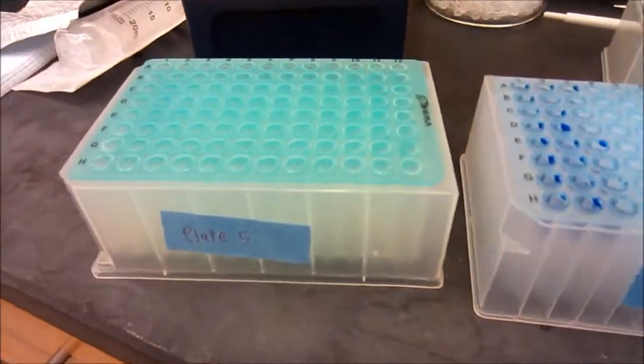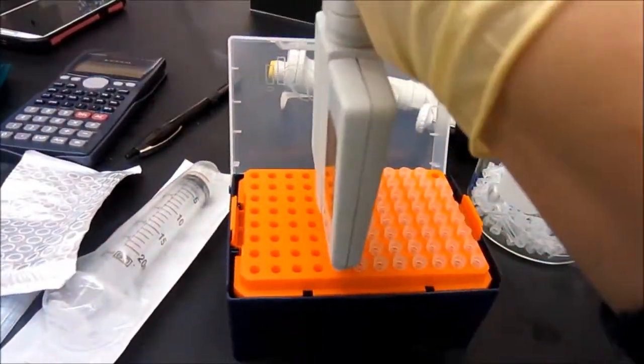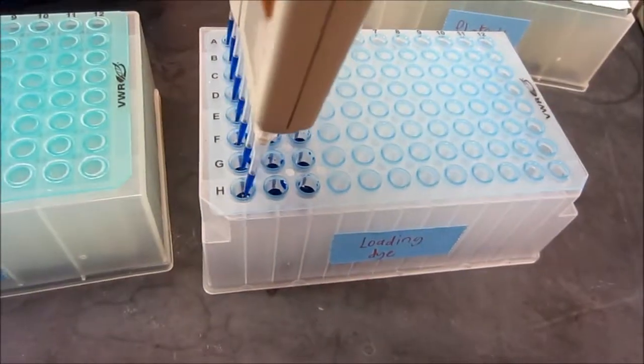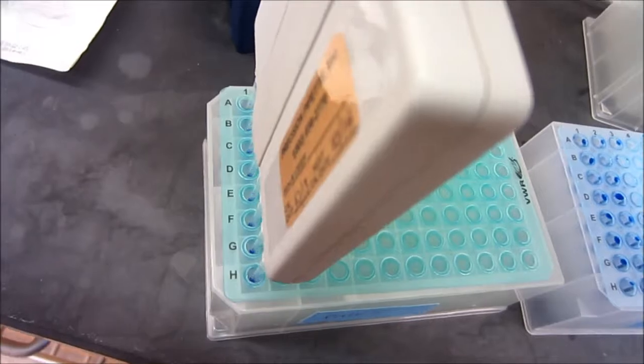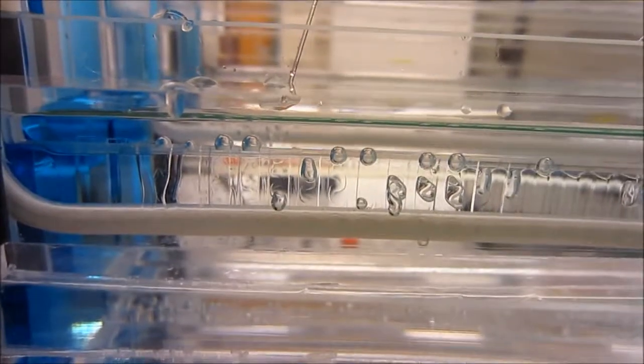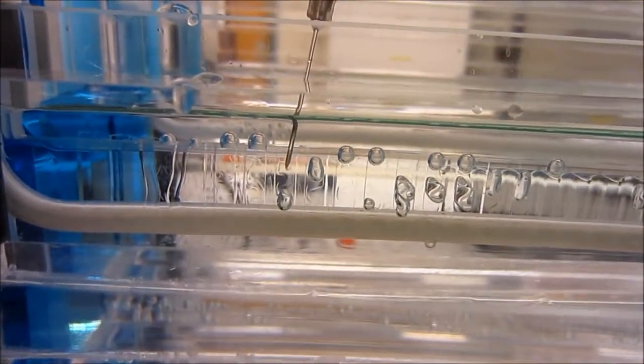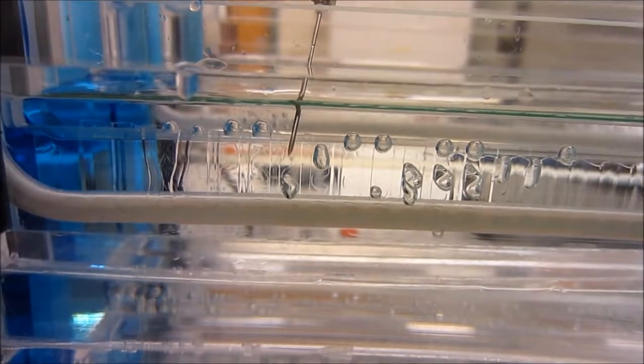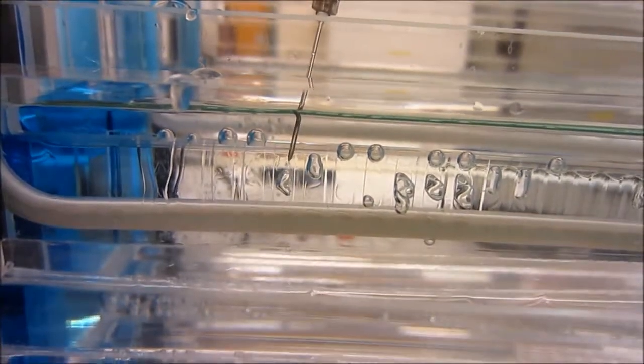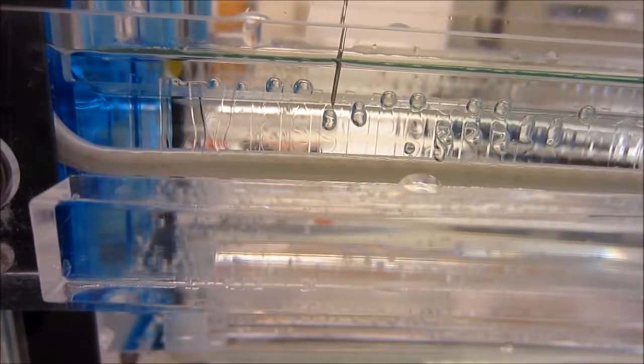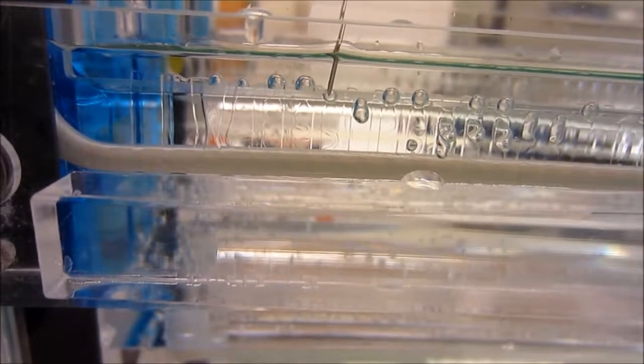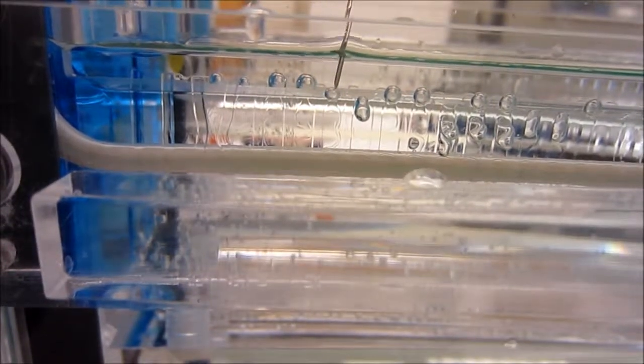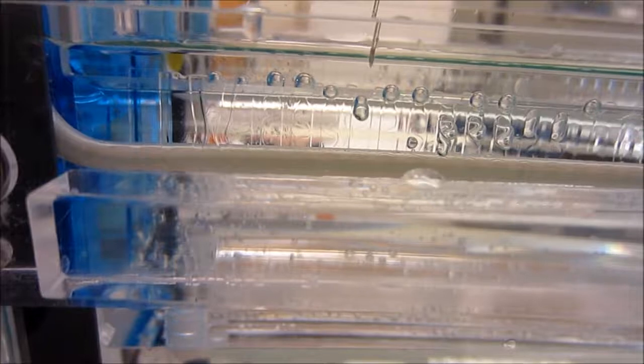In this step, loading dye is mixed into each well of PCR products. Before loading the sample, it is really important to take out all bubbles present in the gel well. This is done by using a syringe to inject a necessary amount of one times TBE buffer so that bubbles will float out.